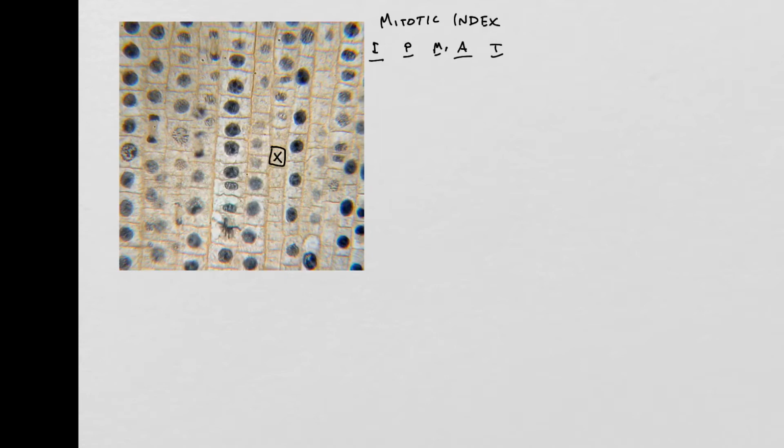And then right over here, there's this weird area where a couple of cells are sitting on top of one another. It's hard to tell what's going on there, so we're also going to ignore some of those things. Right now, you can either pause the video and do this one on your own, and then check back with us, or you can follow along with me.